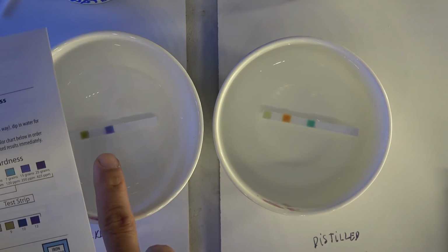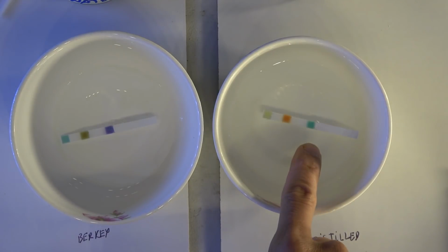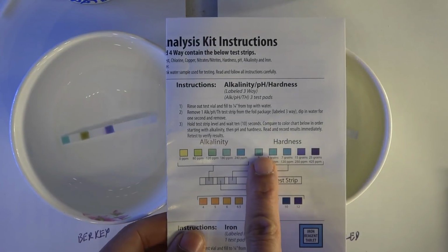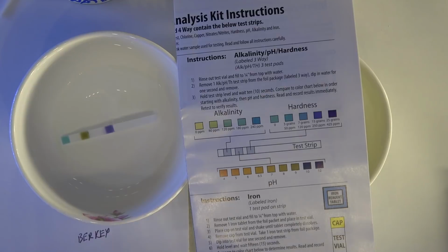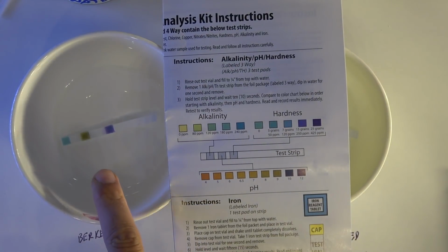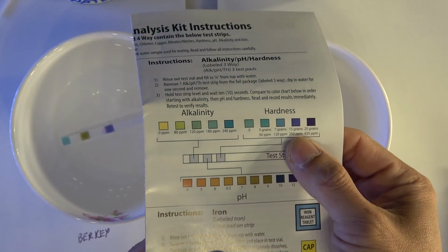And the last one is the hardness. The hardness level is pretty pronounced. It looks like purple, which is very different from the distilled. Distilled still remains green, which is 0 parts per million on the distilled water, but on the Berkey water it's changed to purple. Actually, it's not a deep purple, so it's 250 parts per million. It's still pretty hard. The water is still pretty hard.